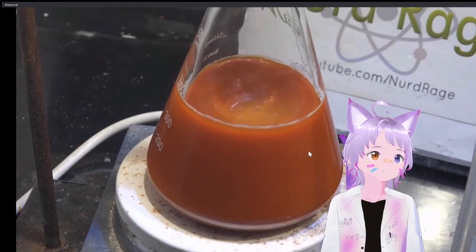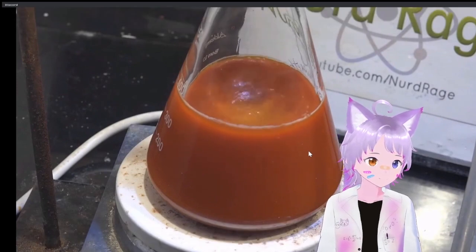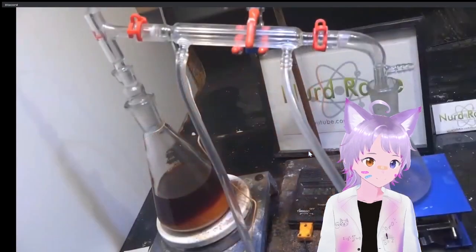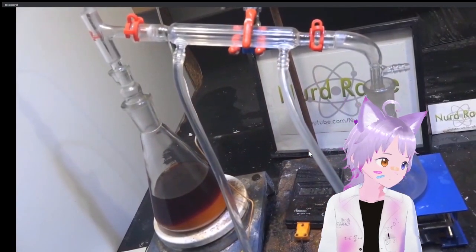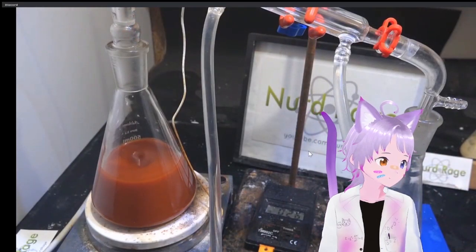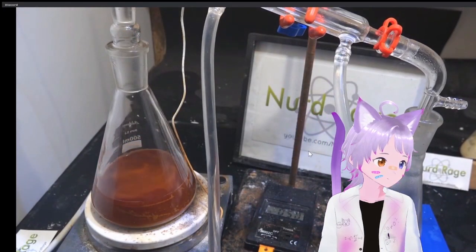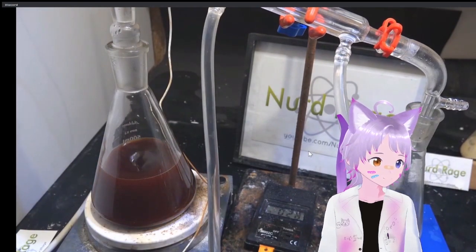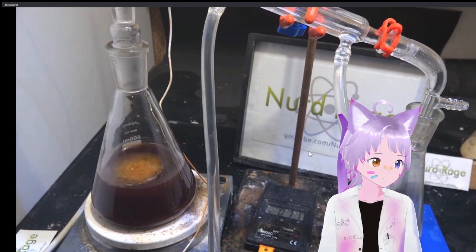Turn off the heating, let it cool. Now we need to start the complicated process of separating out the pyrimethamine. Take off the reflux condenser and assemble a distillation setup around the mixture. Now distill off about 100 milliliters of liquid or so. Then turn off the heating and add in 100 milliliters of water. Turn the heating back on and keep boiling off more solvent.